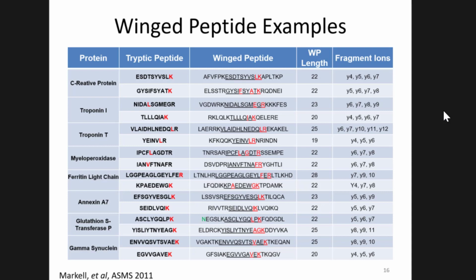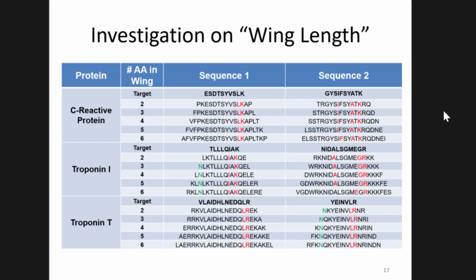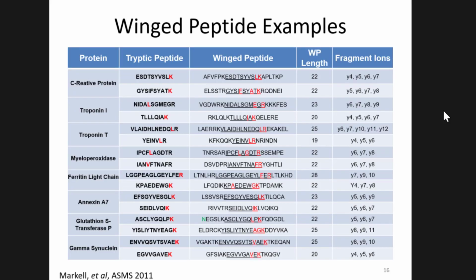And then the winged peptides we had synthesized had 6 additional amino acids according to the native protein primary sequence, before and after. We made some modifications, like this asparagine might have been a glutamine that we were worried would cyclize and screw things up, so we had it substituted in the synthesis. And then you can see they're extra heavy labels so that we could differentiate these super heavy ones from these regular heavy ones. Yeah, this is just complicated, but I don't want you guys to fall into the same pit I did.